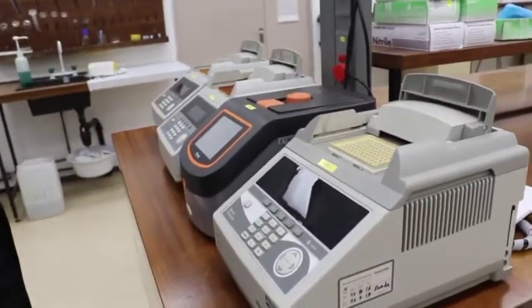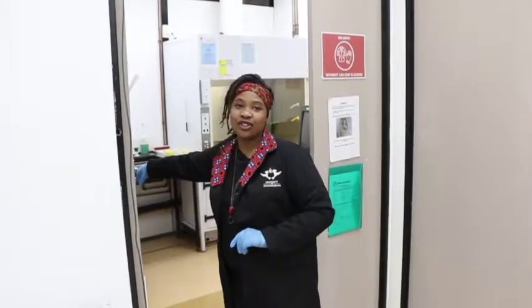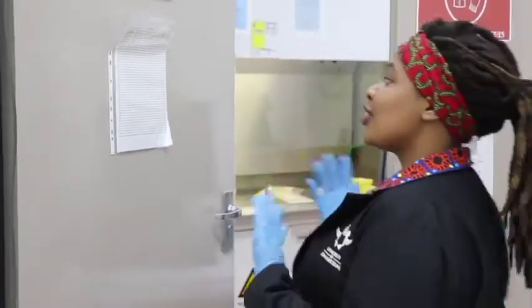We conduct most of our experiments using the centrifuge machine or the PCR machine. The PCR machine actually multiplies the amount of DNA we have in our sample, so we have a tangible amount to process further. This is the gel room. You can't really enter without the proper gear because of exposure to UV lights and other chemicals. In this room, what we do is visualise our DNA on a gel, and this is where we can see if our plant sample actually contains the right amount of DNA for us to continue with our process.